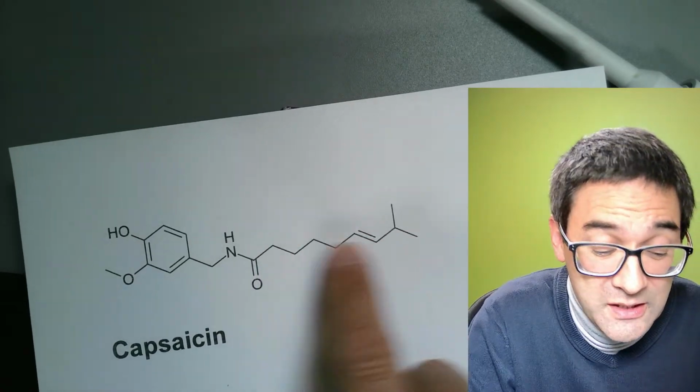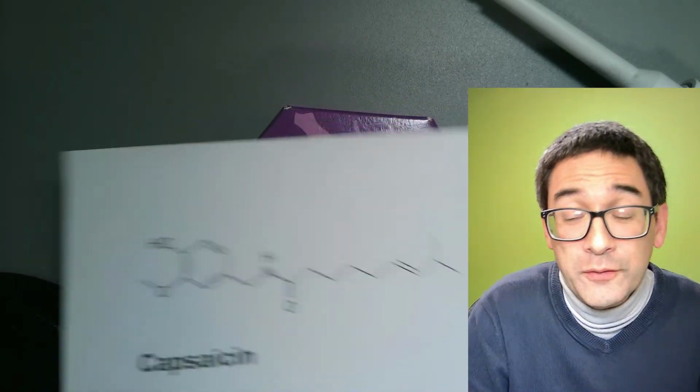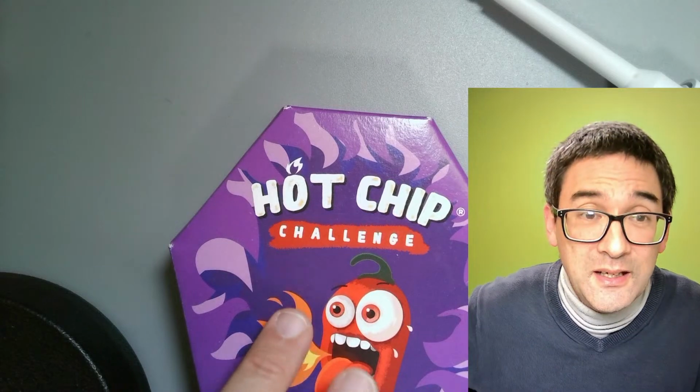Okay, so this is a long hydrocarbon chain here. I'm kind of worried that if I mix this spicy chip with water, maybe it's not going to dissolve the substance very well. So we're going to try that out in any case, and then we're going to see how well this works.